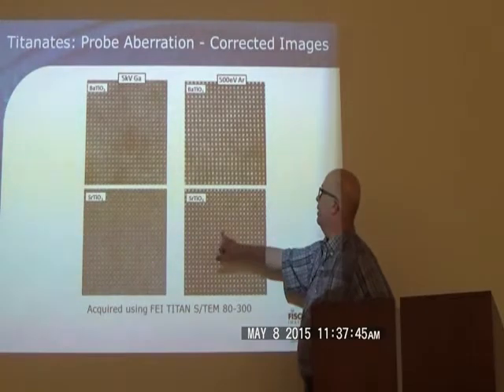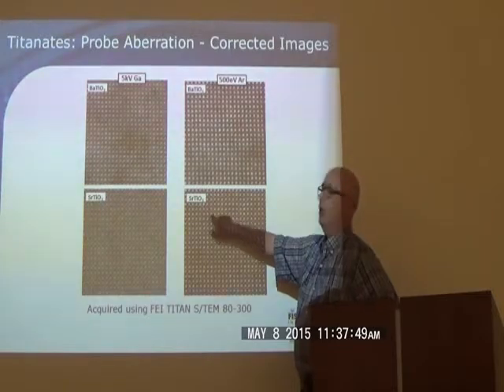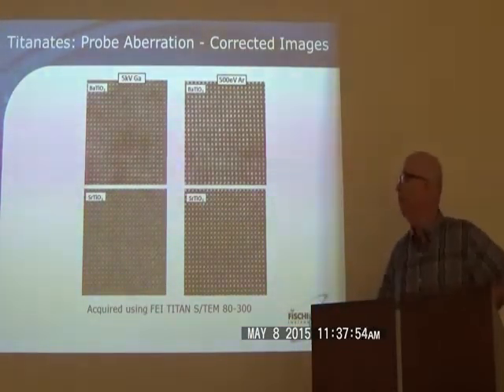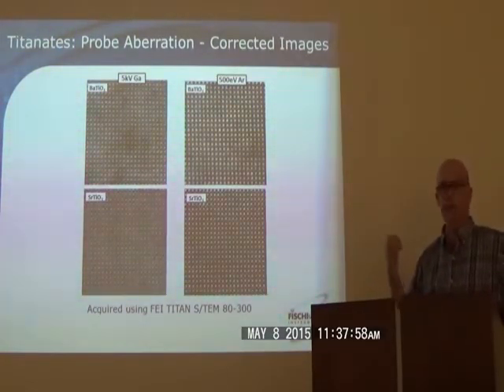Now you can definitely see 2 where you're sitting from, the bright ones and the dark ones, right? Well, often if you zoom in, you can even see a 3rd one, which you can't see in this image. But all that's done by proper focused ion beam technique and nanomilling on these types of materials.